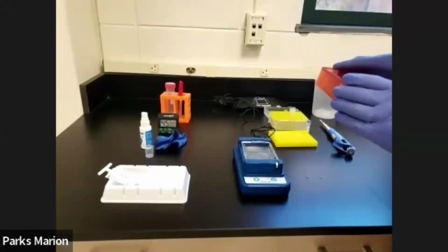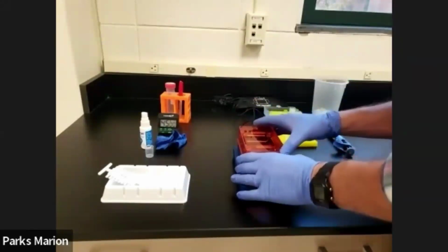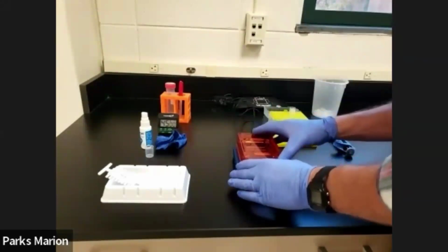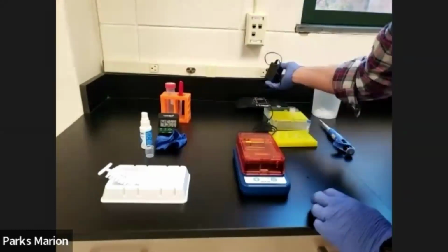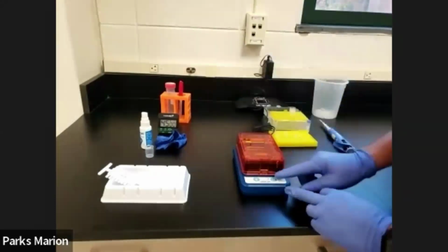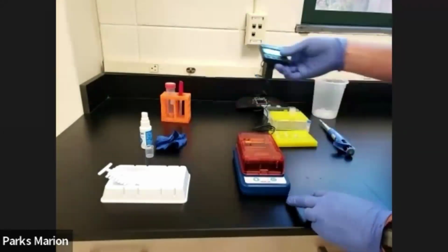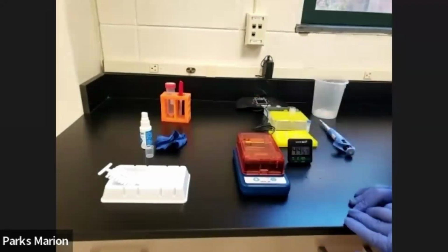We'll place the cover onto the machine very carefully, nice and slowly. We don't want to disturb the products that are in the sample. Then we can plug in our machine, turn it on, and begin our timer. We'll come back in 45 minutes.